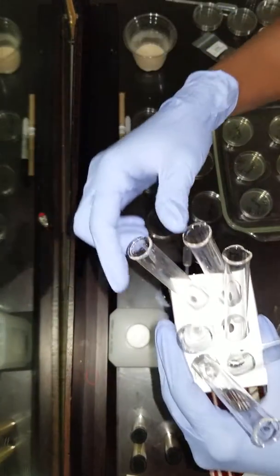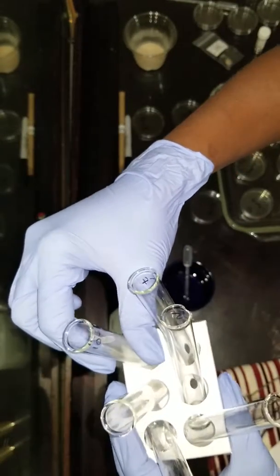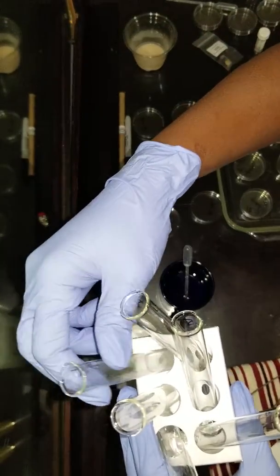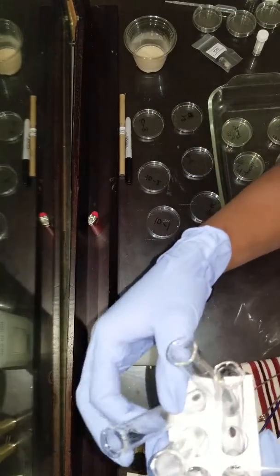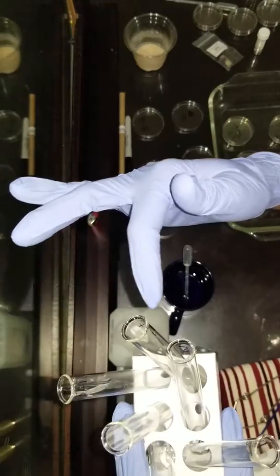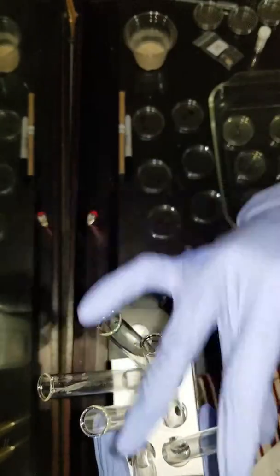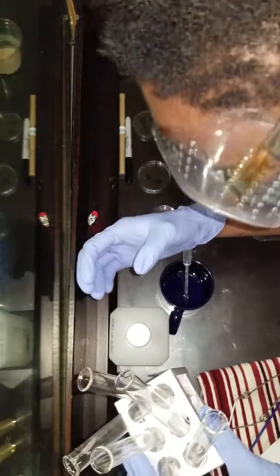Then in each test tube, this is test tube 1, I put in distilled water as instructed, 2.25 milliliters. I labeled each test tube 1, 2, 3, 4, 5, 6, that's 10^-1, 10^-2, 10^-3, 10^-4, 10^-5, 10^-6. And so each test tube got 2.25 milliliters.